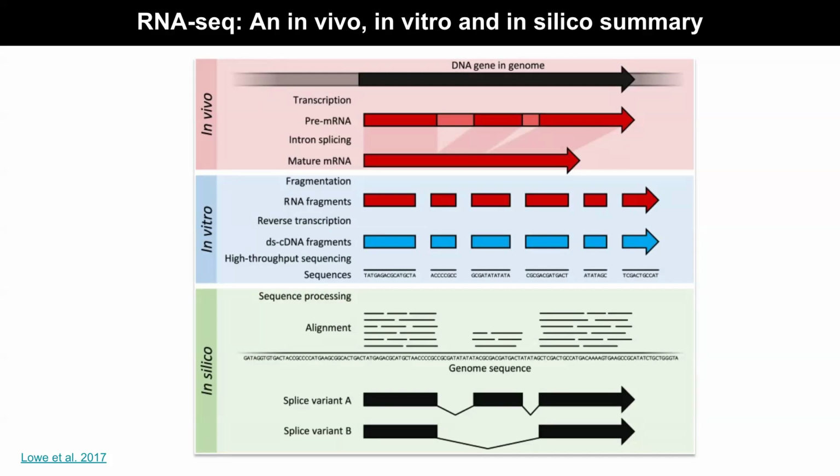Do we know this vector before? No, you know this after. We're just exactly going in that direction. How do you figure out what this vector is? So this is at the gene level, which is a good starting point. You want to know which gene is making how much of a protein. But sometimes, in certain cases, particularly in diseases, you also want to know which isoforms change.